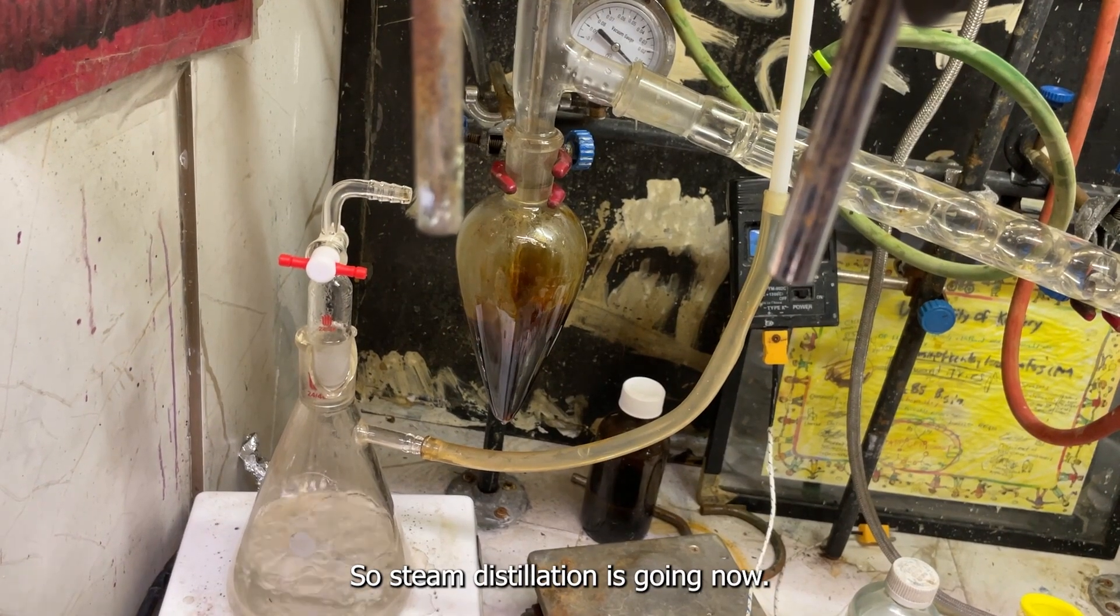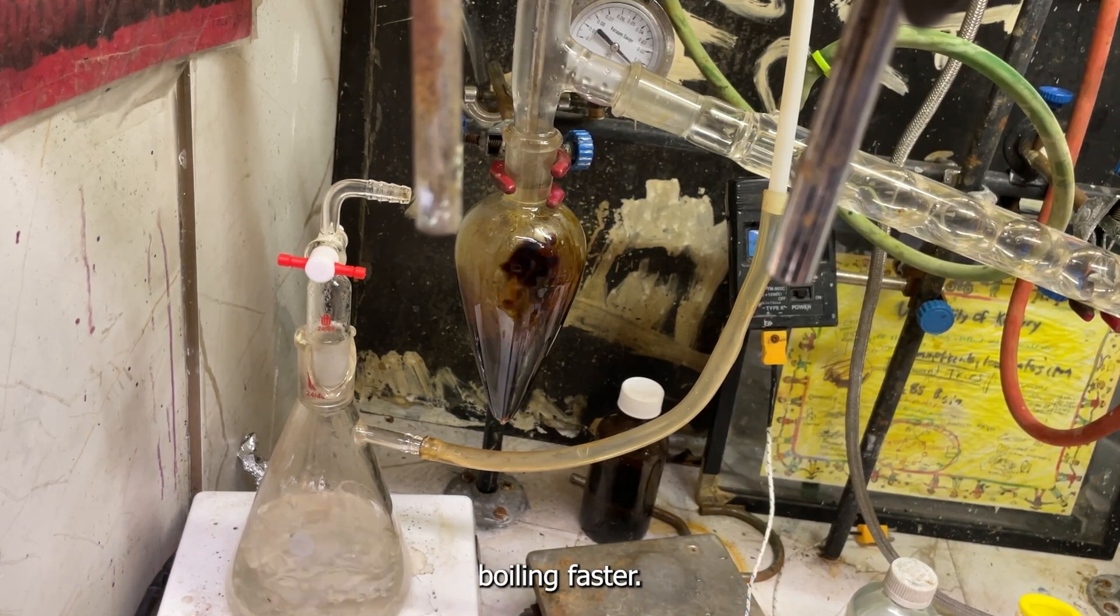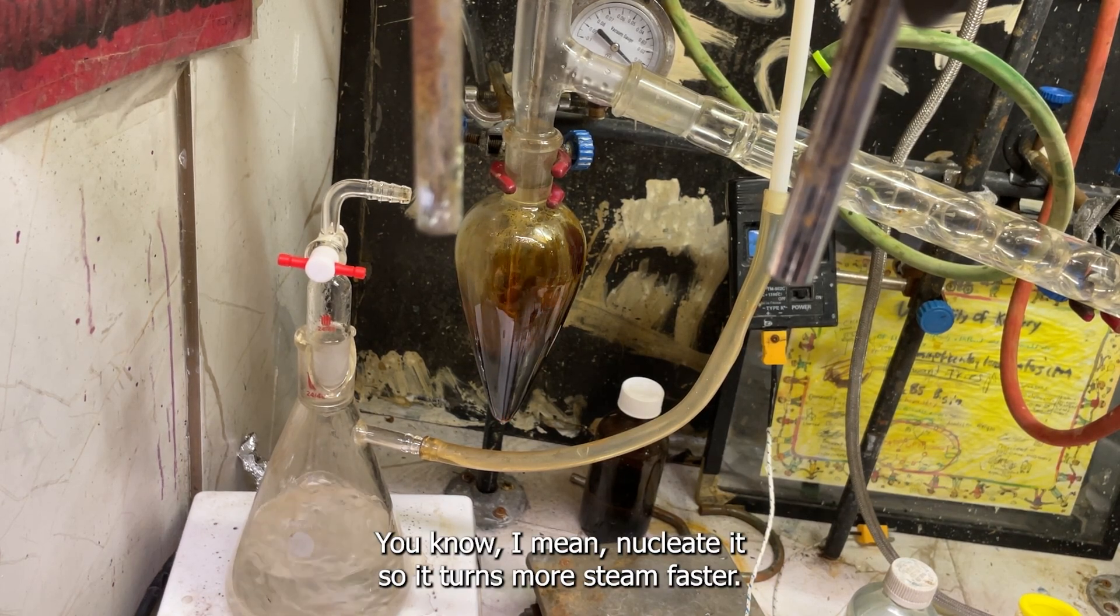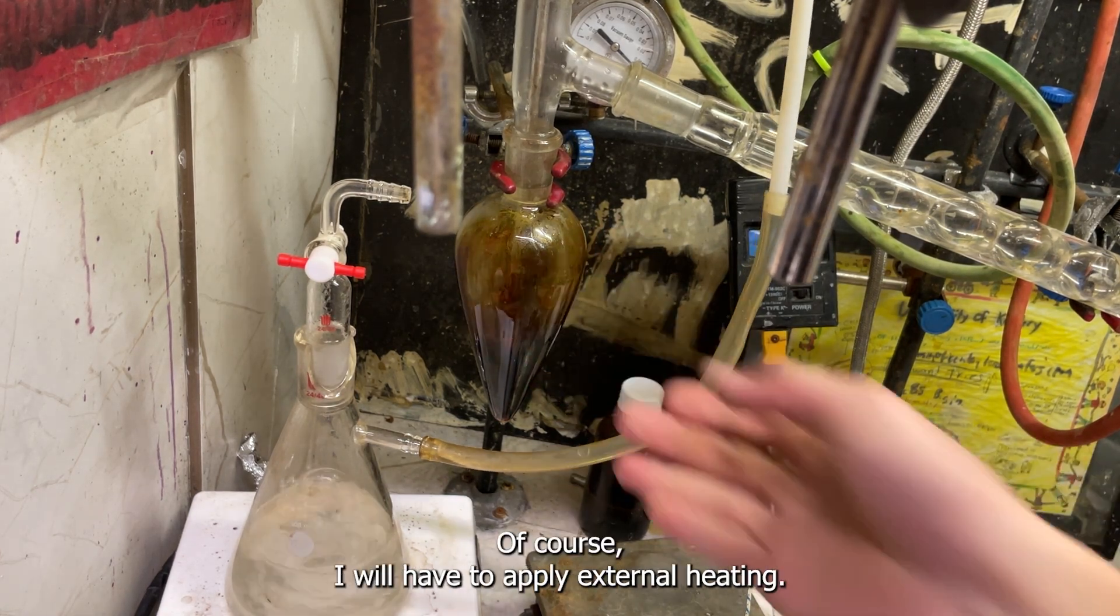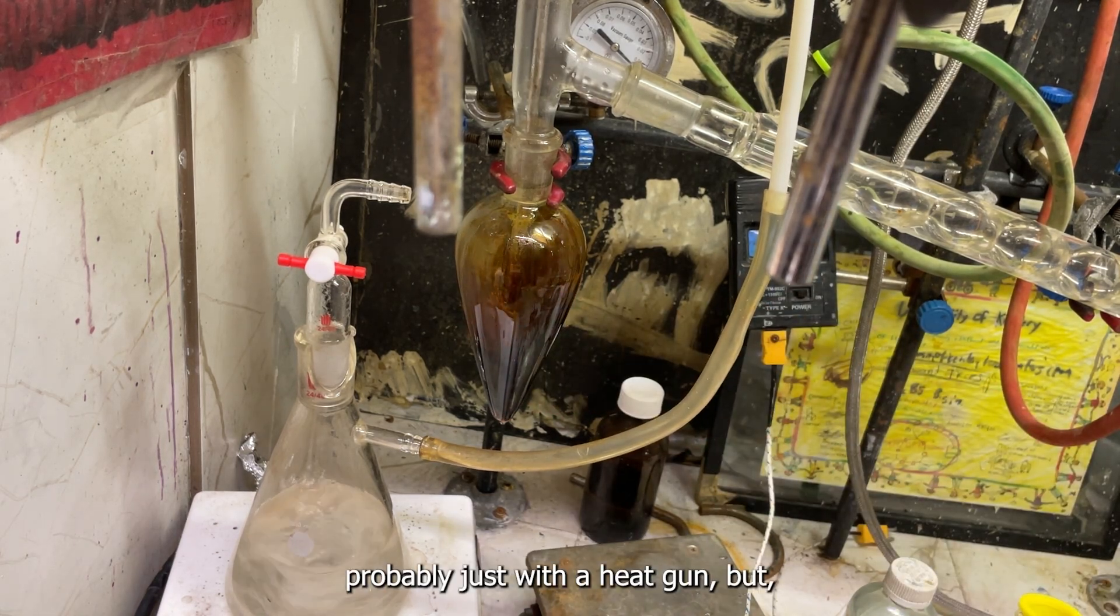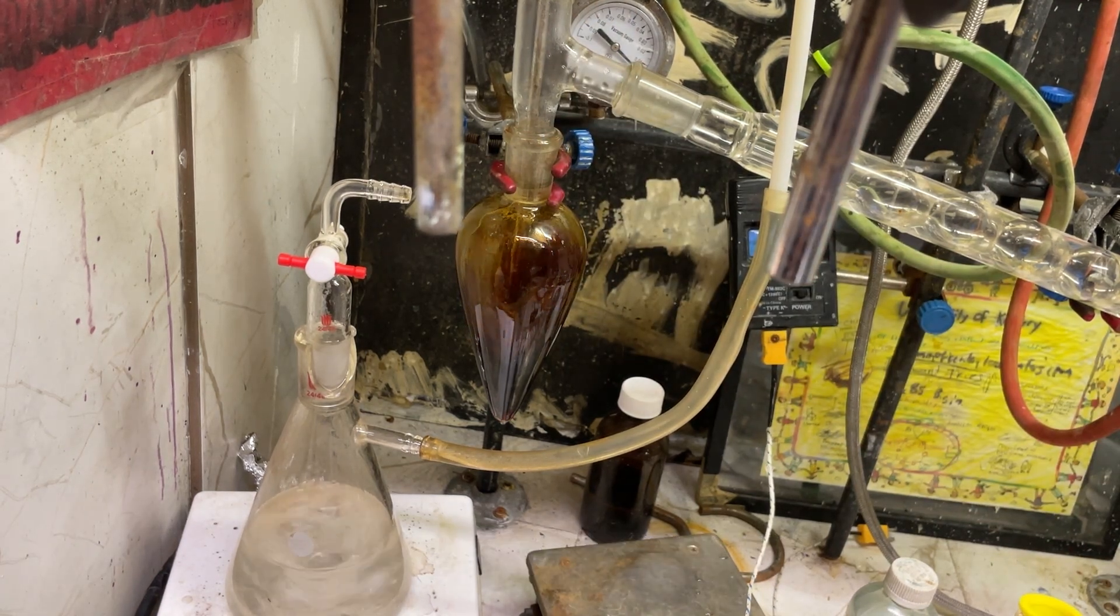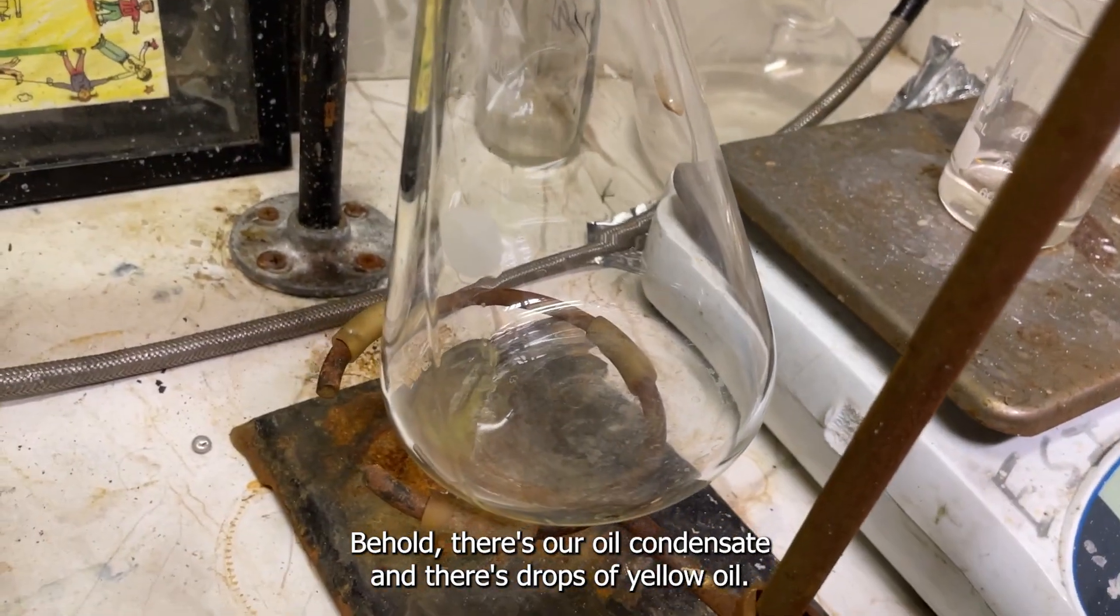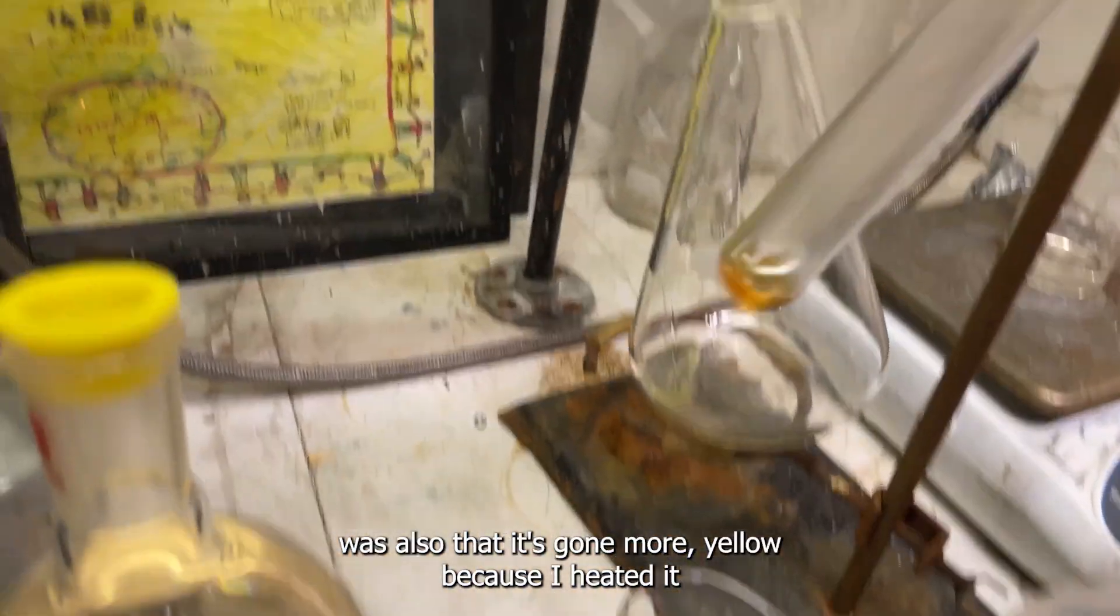Okay so steam distillation's going now. Let's turn up the stirring to get it blowing faster. It's nucleated so it turns more steam faster. This is getting hot of course, I will have to apply external heating probably just with a heat gun. We'll start getting condensate over. Behold, there's our oily condensate and there's drops of yellow oil. Yes it is supposed to be yellow, or I think anyways, at least the last sample I made was also that. It's gone more yellow because I heated it to try to dry it.